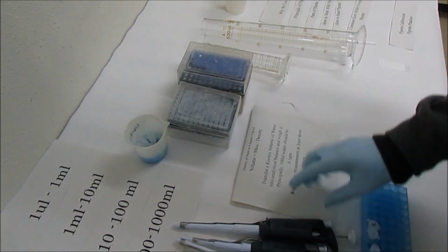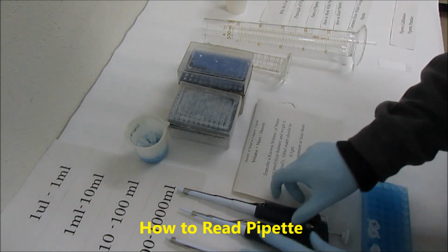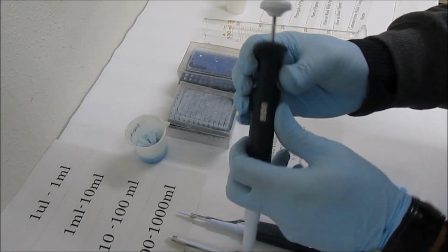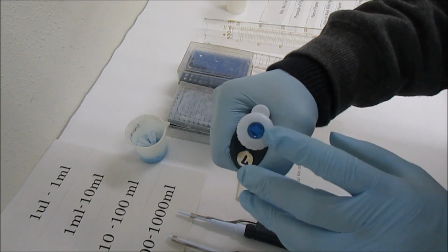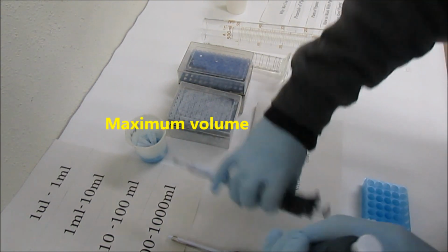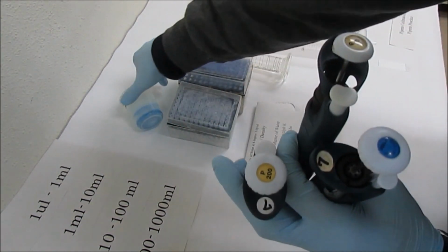Now I'm going to tell you how to read pipettes. Let's start with the bigger one. First, look at whatever is written on the top of the pipettes. Here it's written P1000, P20 and P200, right?